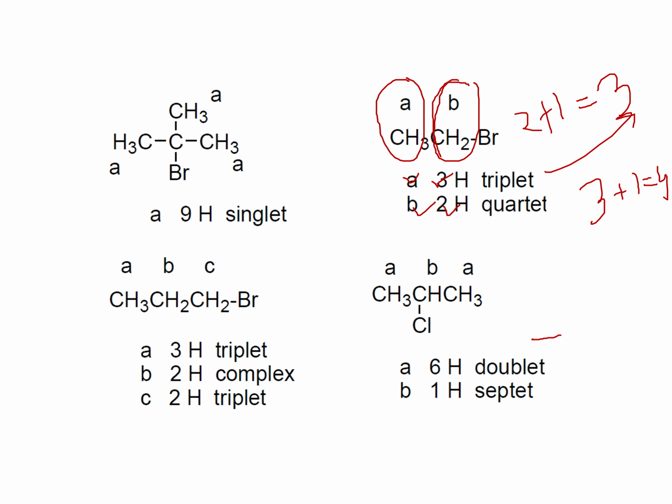If I provide the spectrum here, then how would it be shown? Okay, for B, what would be the position? For B, the position of the splitting would be towards 12. For B, we will have a peak, so quartet. How is it drawn? It is drawn in that way, like that, like that. So quartet is drawn in that way. So for A, which environment will have a triplet, how is triplet drawn? Triplet is drawn in that way.